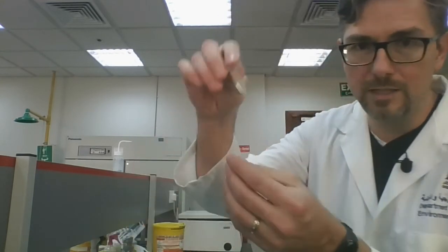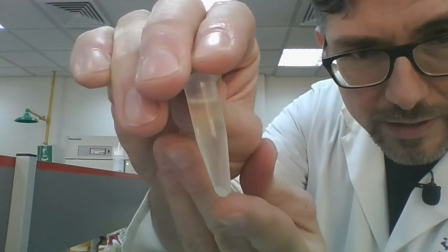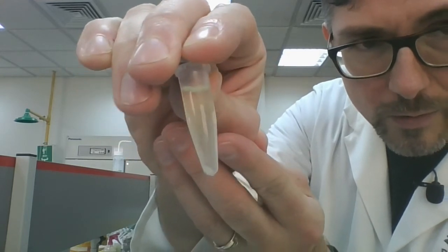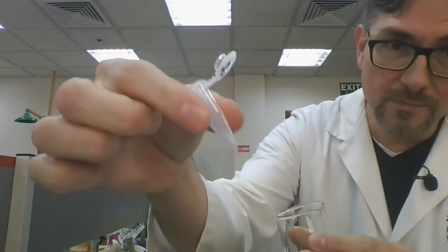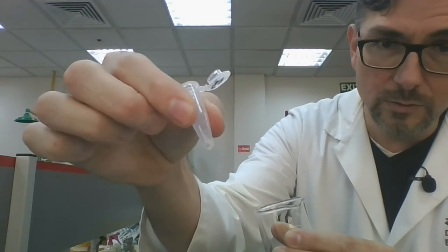Once I have just the pellets, and so we can see here, down at the bottom right there, there's a white pellet. Everything else is a clear solution. That's the LB. Okay, so we're going to be removing the LB. Just pour it out. The pellet is stuck on there pretty tight, so go ahead and just pour. And I'm just going to shake it out. So don't be shy about it. You can shake it out. The pellet's not going anywhere. You can see here, the pellet is still there, and all the liquid has been removed.